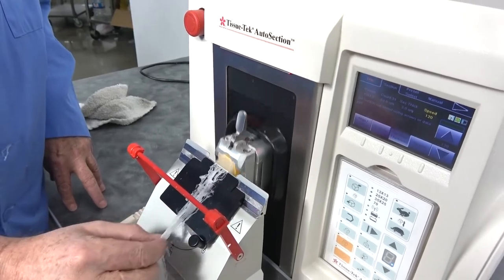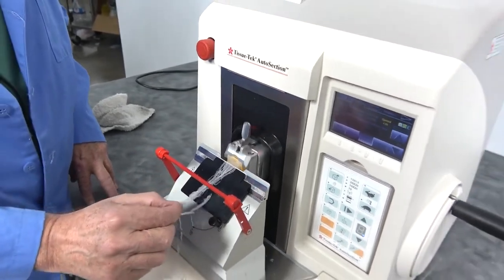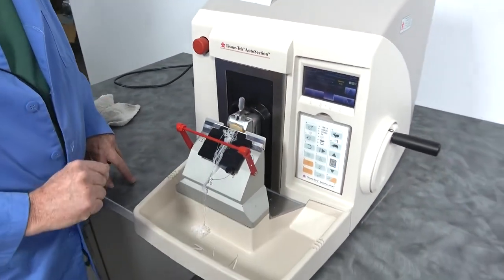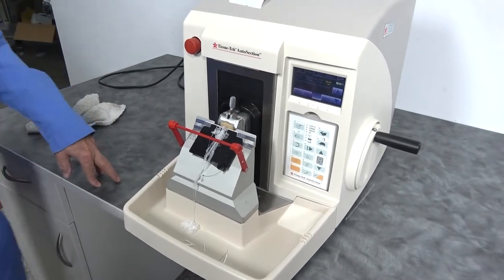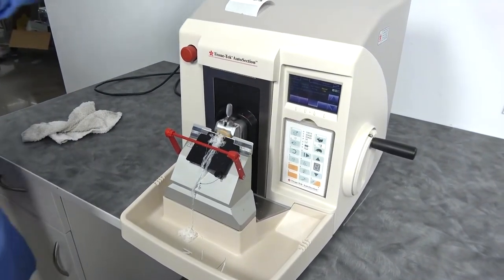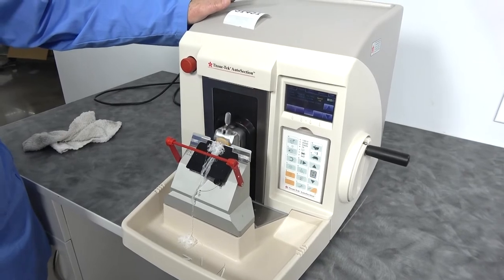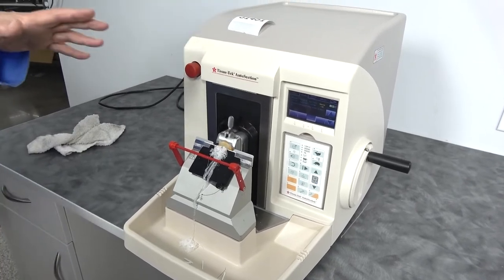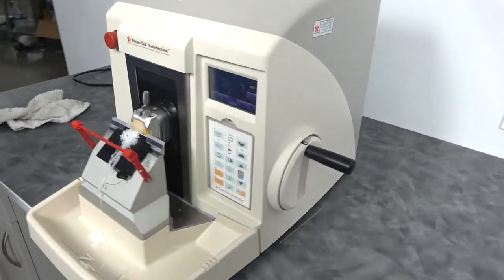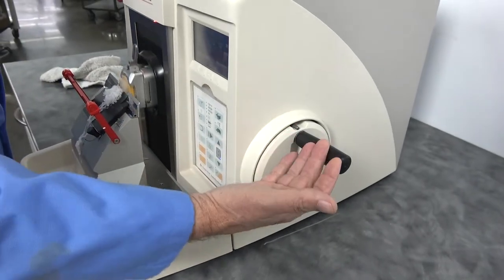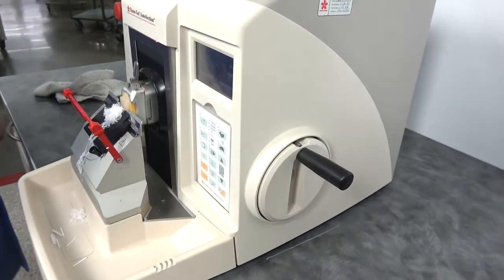We are not microtome sectioning specialists. We make sure they work. This unit is a dynamite worker. Great for production level work. It can be run as a manual microtome as well. The incredible feel on the handle. Very nice unit.